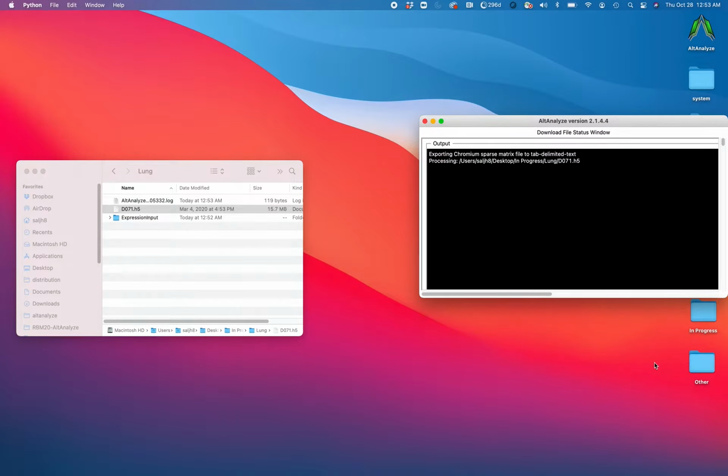The program will proceed to process those files, to generate any intermediate files, identify initial clusters, and then identify final clusters using a method called non-negative matrix factorization. In this case, the dataset has 6,800 cells, and so by default, it's going to downsample it to 2,500 cells. You can set your own number of cells to downsample to, or not downsample at all. In this case, you would just set downsample to 7,000, for example.